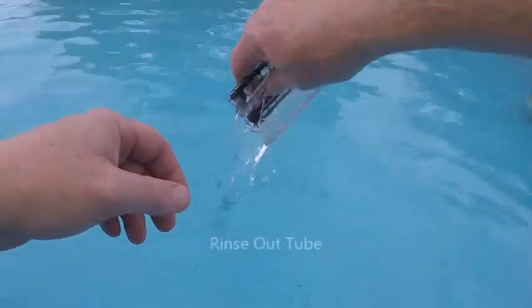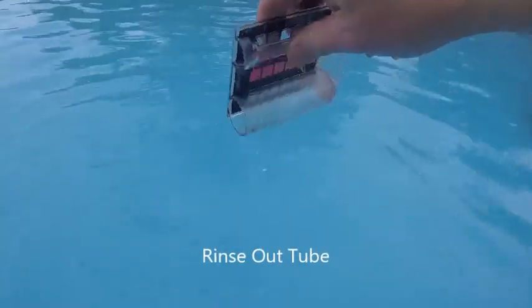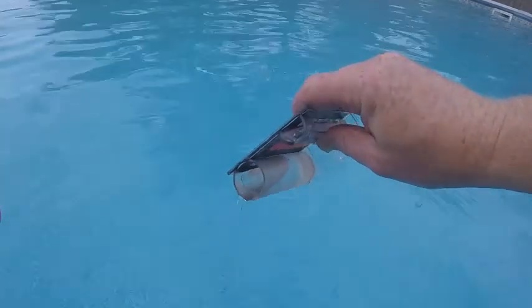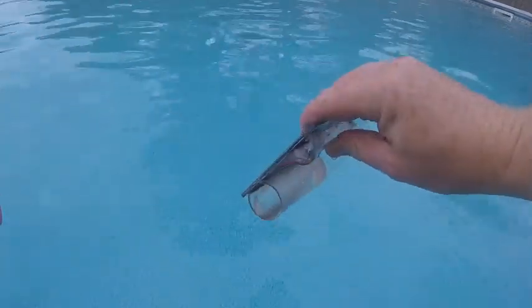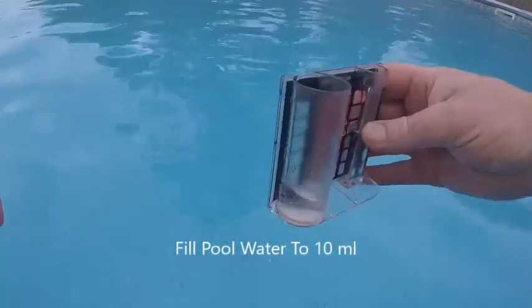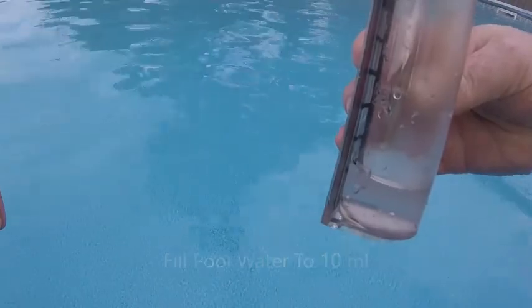So first, rinse out the tube. You may just have a single tube — that's fine too. We're only going to use this one on this side anyway. Get down to right at 10 milliliters.